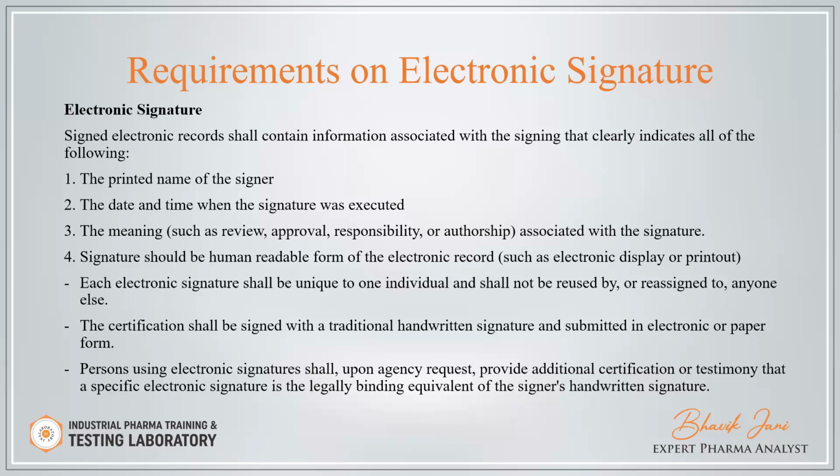Signature should be in human readable form of the electronic record. All the signatures should be in human readable form. It's not like a barcode that nobody can read. It should be human readable. Who signed, when signed, and why signed.